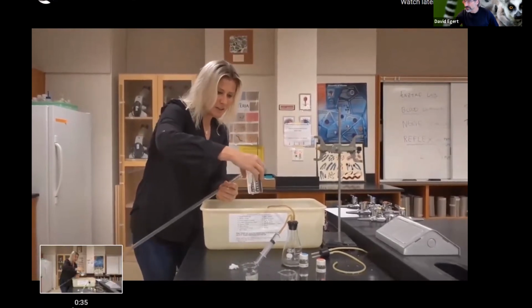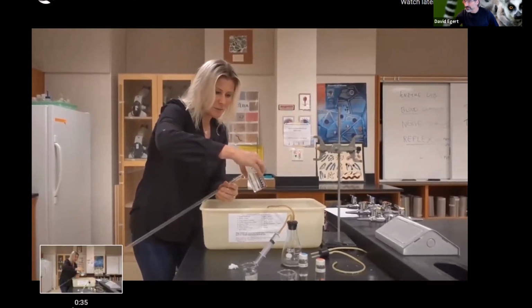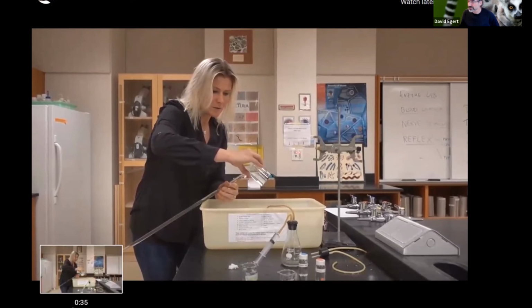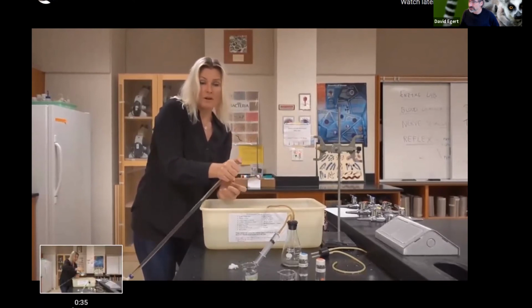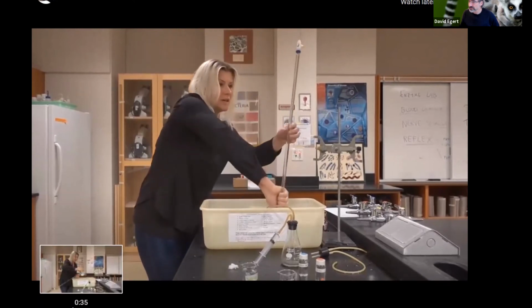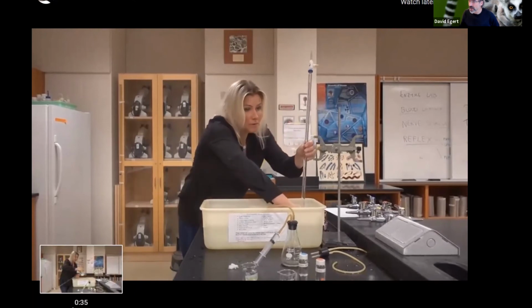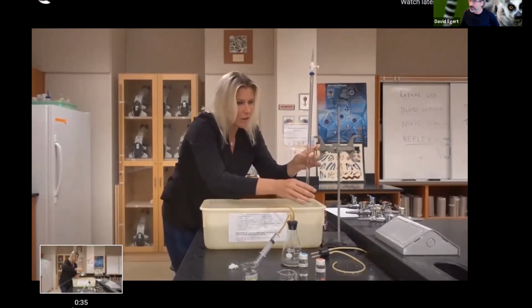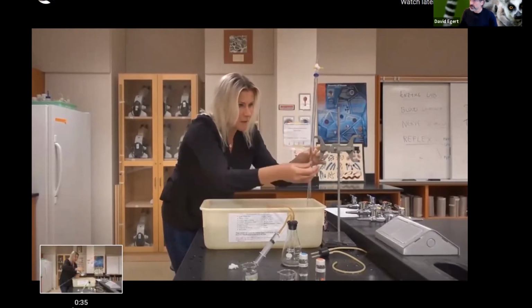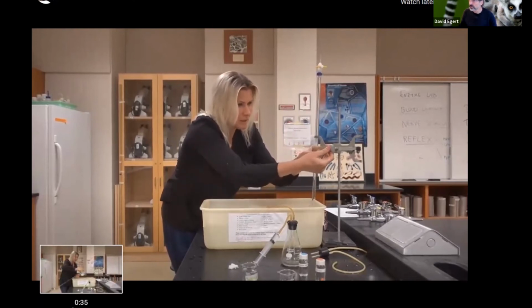And if you are steady on your hand, you can just pour it in. You want to fill it all the way, not just to 50, all the way up. Stick your thumb on the end, invert it, and then make sure you aim so the numbers are easy to read. So once you're under the water, you can let go of your thumb, and we're just going to clamp it.